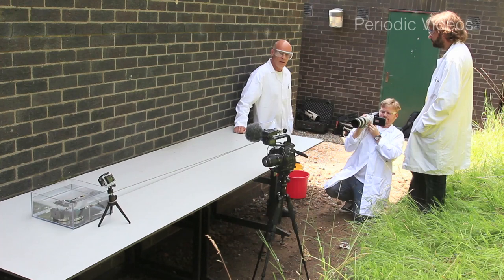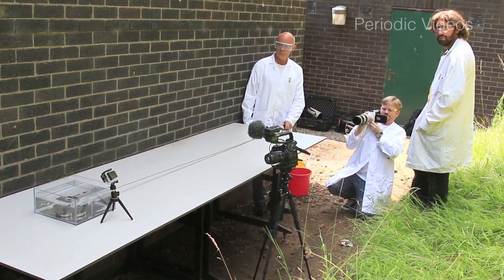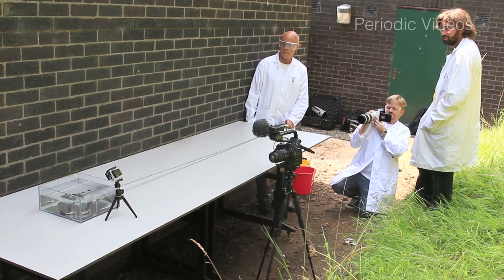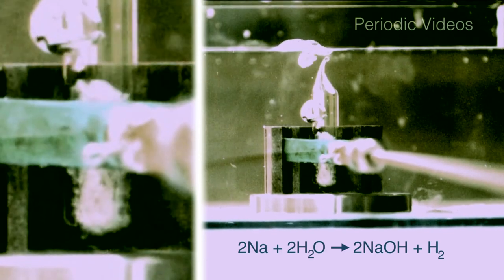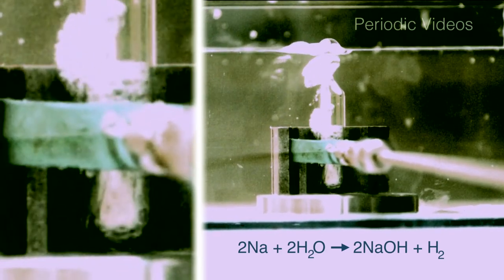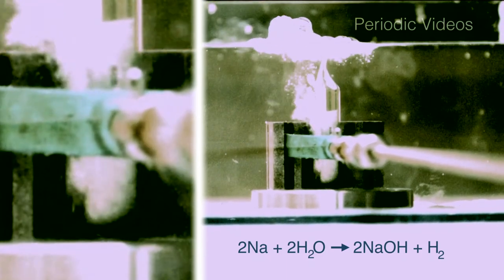The amount of air in the tube is very small compared to the amount of hydrogen you expect to be generated by full reaction. The experiments were done outside so that we had bright sunlight, and also so that if there was an explosion it wouldn't cause any harm in the building. What you see is that as the pin starts breaking, the bubbles coming out are — I believe — hydrogen, and the hydrogen just bubbles up to the surface.